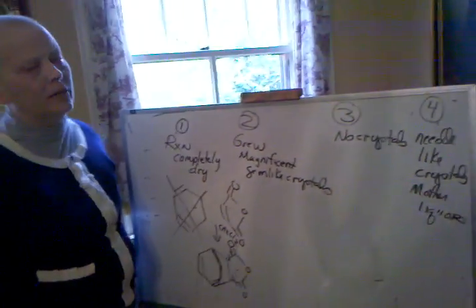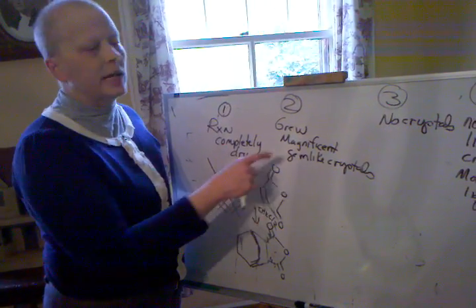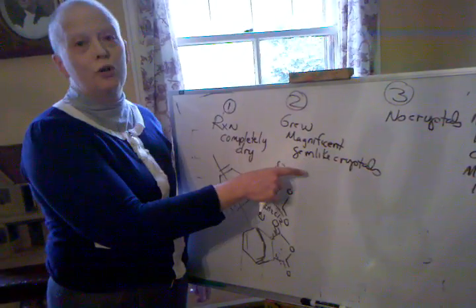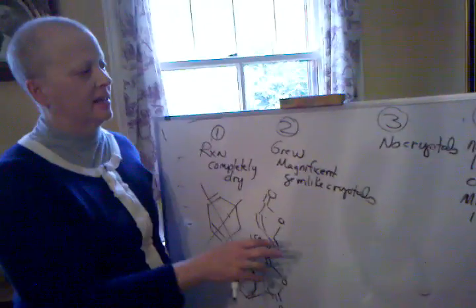The bad thing about these crystals is they tend to have liquid centers. And the center tends to be the mother liquor, and the mother liquor has the contaminant in it. So as soon as you show it to all your friends and take all your pictures, you're going to have to crush those crystals and get that liquid out.